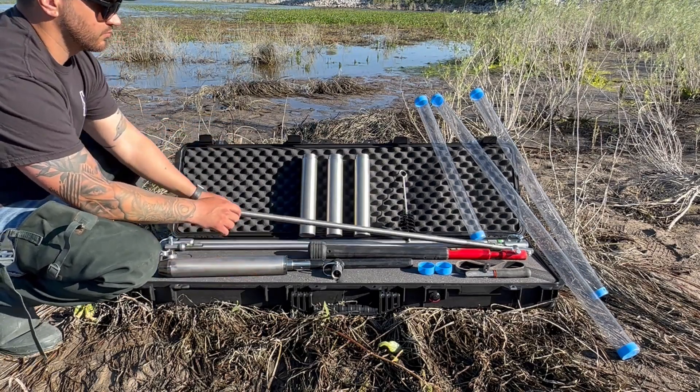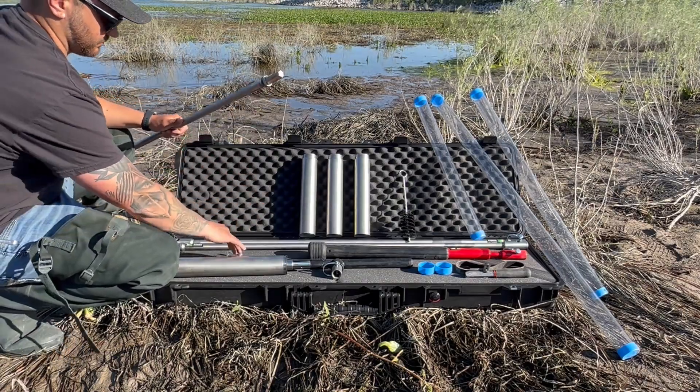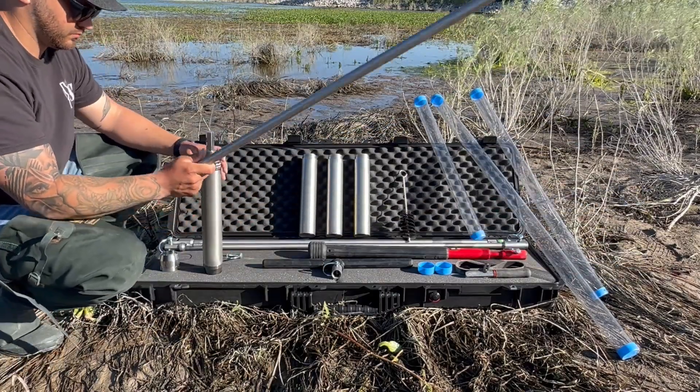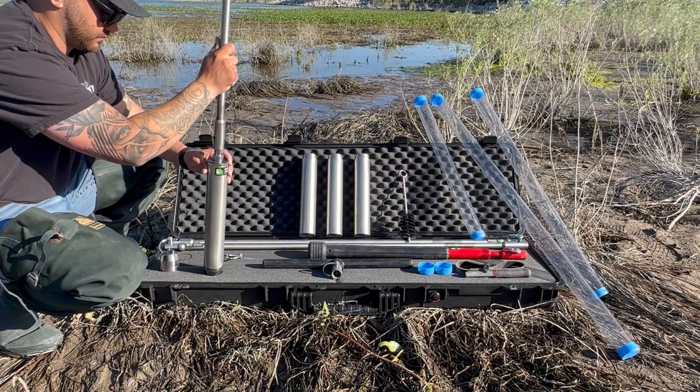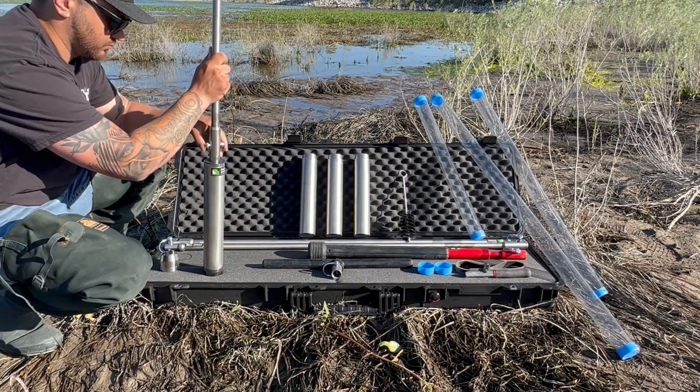Now that your sampler is fully assembled, let's proceed to connect additional sampling equipment that may be needed at times. First, attach the extension to your sampler. To ensure a secure connection, push the snapper pin through the connection hole and clip it together.